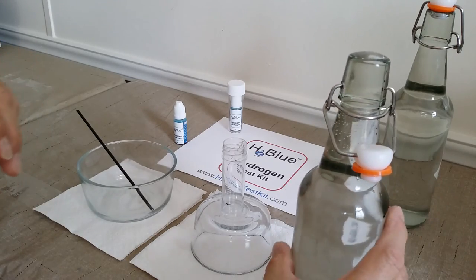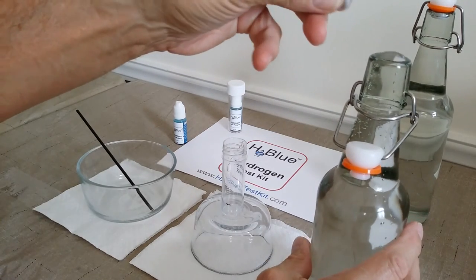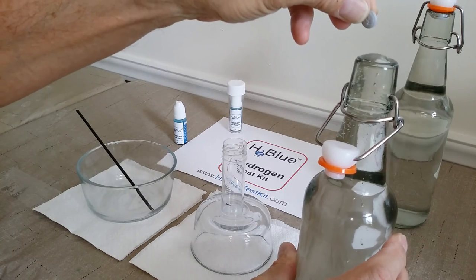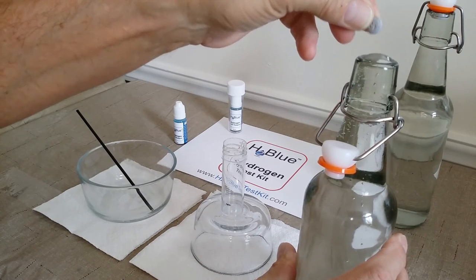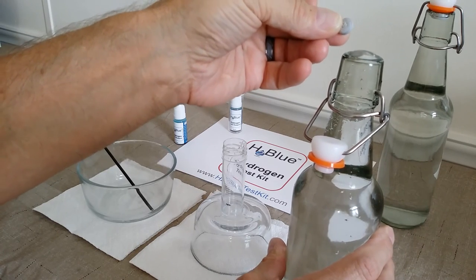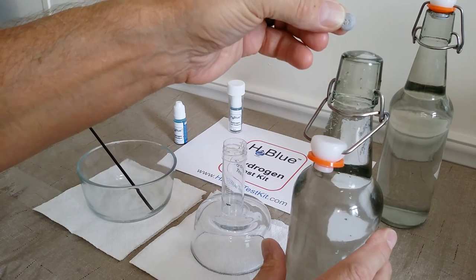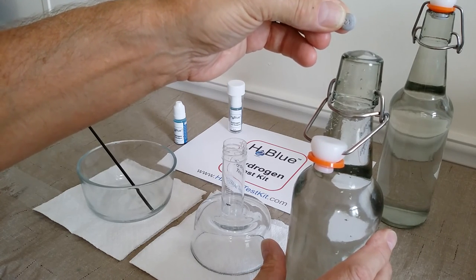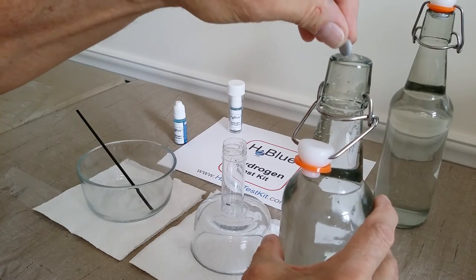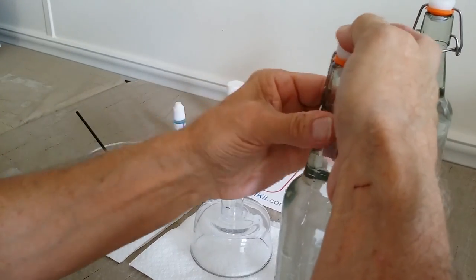So what I'm going to do is show you how you just drop this tablet in, and then you want to immediately close the lid as it starts to generate gas. I recommend using one tablet. It produces over 1 ppm of dissolved hydrogen easily. If you go as many as 3 tablets, you could fracture the glass bottle, so be careful there. When you drop the tablet in, you want to immediately press this seal down and lock the lid.